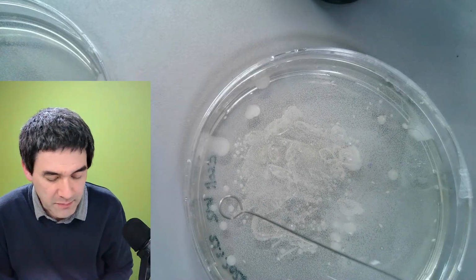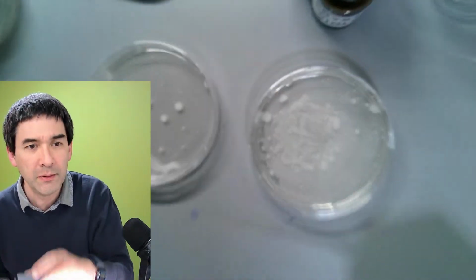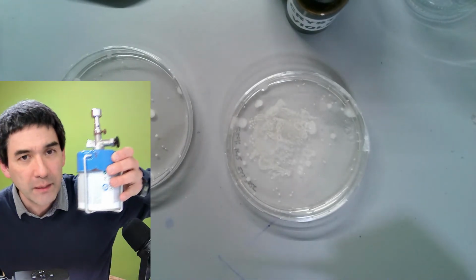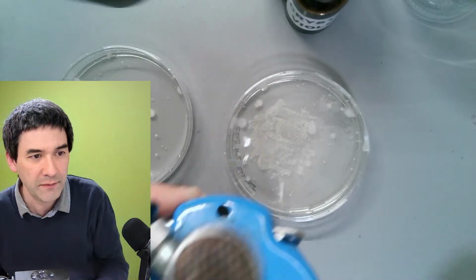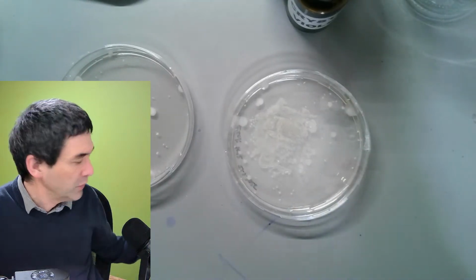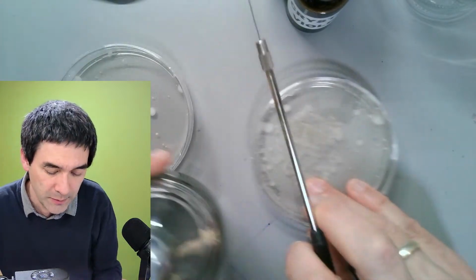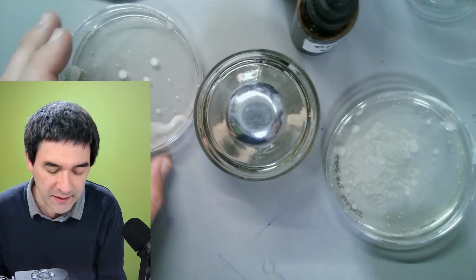And this is basically what I'll do. Normally, every time you work in a microbiology lab, you need a gas burner. I've got one over here, and I'm not going to use this because it's too dangerous, right? I'd have it here, and then I'm going to break my camera, which is right on top of it. So I'll be using a little alcohol burner here, because I'll be disinfecting this.